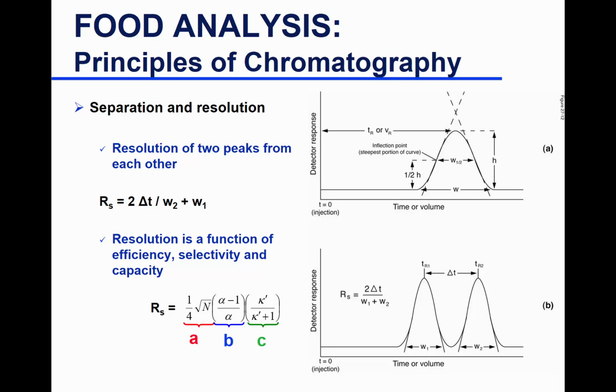Your sample has now diffused this much within the column, and now it starts to come out. So there's nothing here, and then it starts coming out. Low concentration, and then more of it comes out, and then more of it, the highest concentration, and then back to the lowest concentration, and then all of it leaves the column.